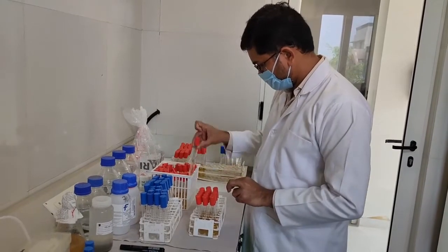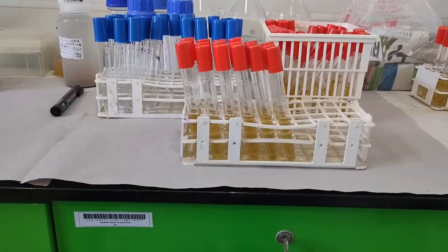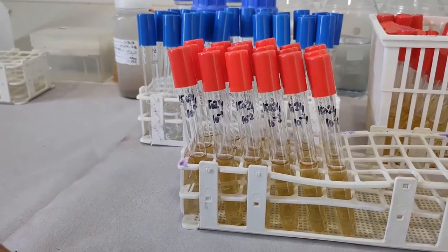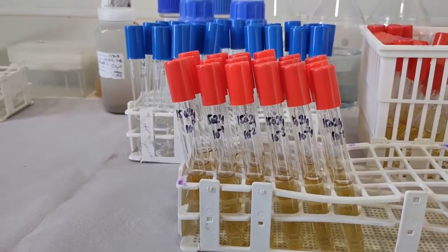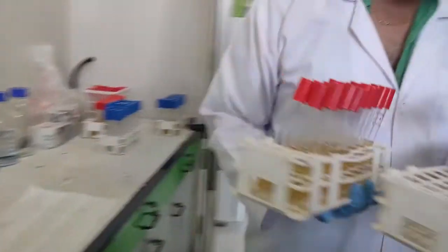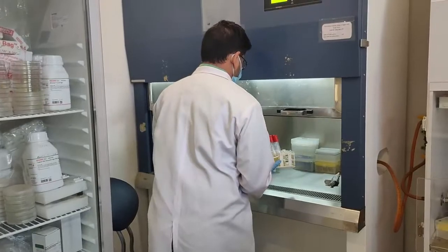Take the required number of tubes with sterile media and arrange them in rows of 3 each in a test tube rack. Label each tube with the sample number and dilution factor — 3 tubes in the 1st row with 10⁰, 3 tubes in the 2nd row with 10⁻¹, and so on. Keep these two test tube racks with properly labeled sterile tubes inside the biosafety cabinet.